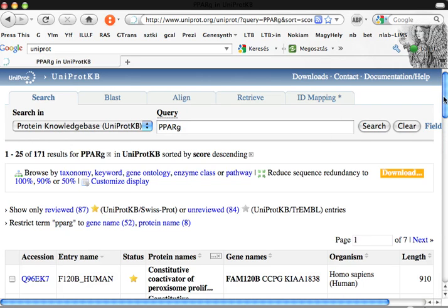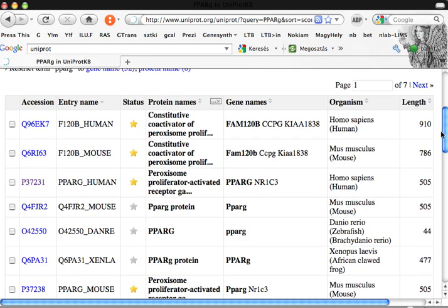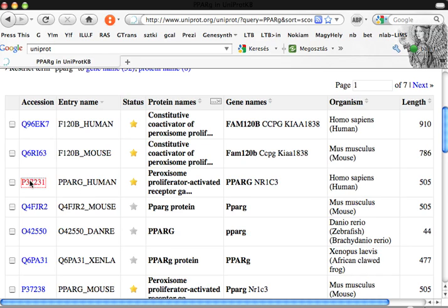Here we have some results. You have to know what you're looking for, not a co-activator of PPAR Gamma, but PPAR Gamma itself. Here is the Homo sapiens PPAR Gamma, so let's click on it.